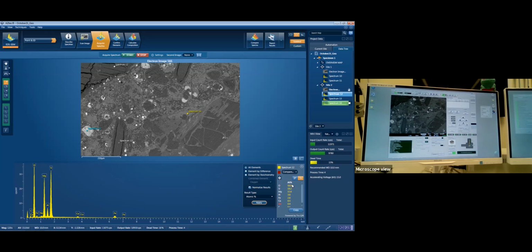So this one is closer to the pyroxene side of things. We can start rounding things up a little bit and call this 60 rather than 58.9 and 20 rather than 18.2. That means we've got 3 oxygens to 1 silica. So this is some sort of pyroxene.